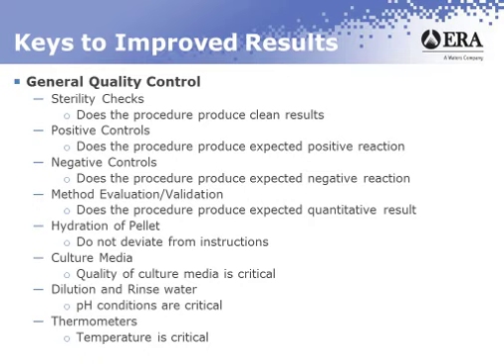You want to make sure that cold samples are incubated at the test temperature for the required time. You want to record temperature on the various shelves, if it's a fairly large incubator. It's very possible that the temperature at the top is not the same as the temperature at the bottom. You want to make sure that you know that it's at the right temperature for where you're incubating the samples.